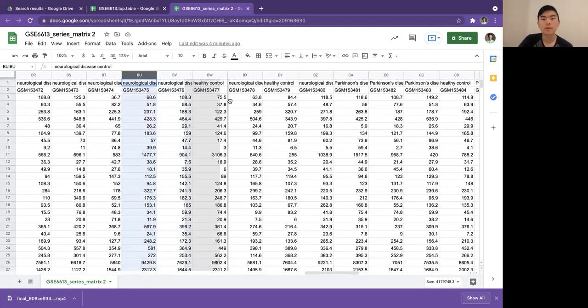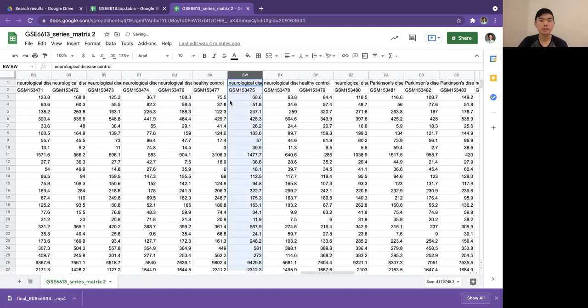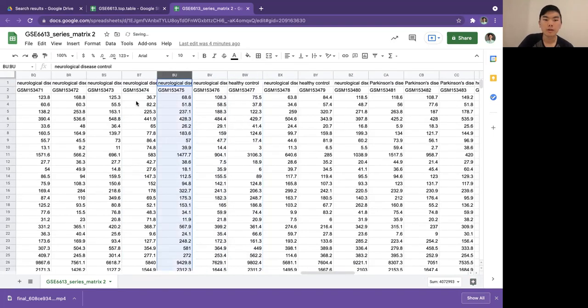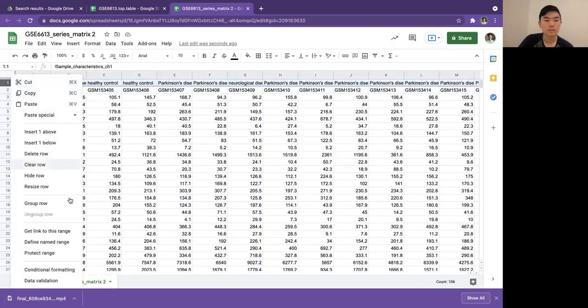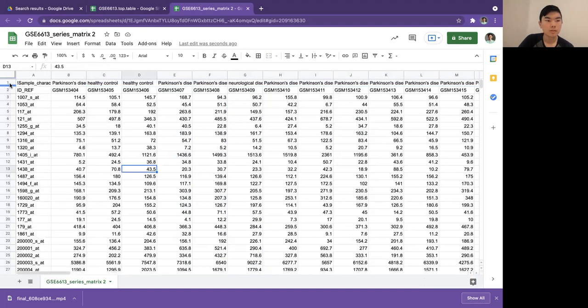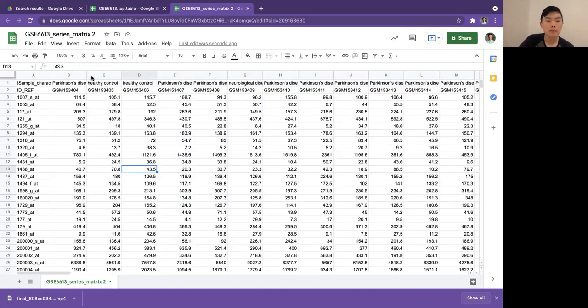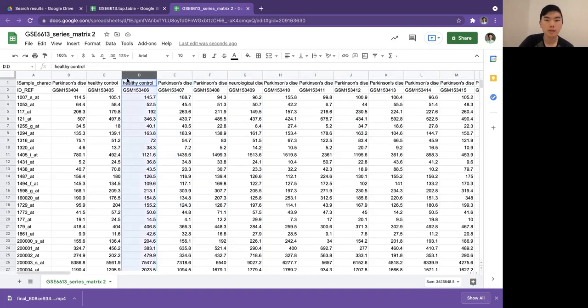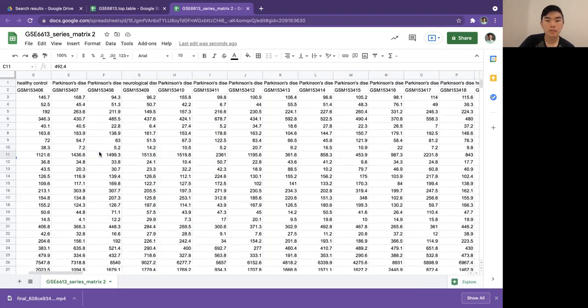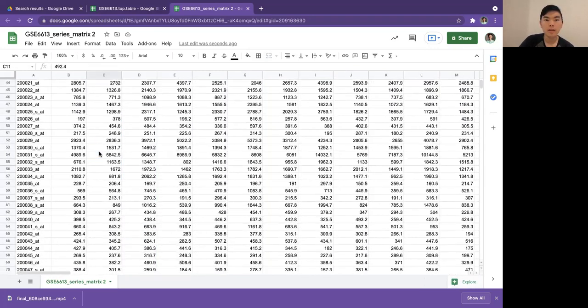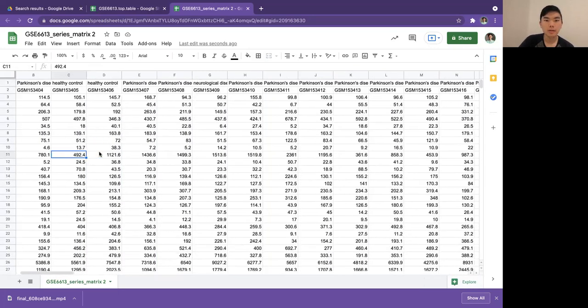But for a larger data set it's going to take a while to do that because it has to move around all this data. So actually sometimes I find it easier to just sort the txt file that we imported by alphabetical order before we import it. That way all the Parkinson's will be together and all the healthy controls will be together.